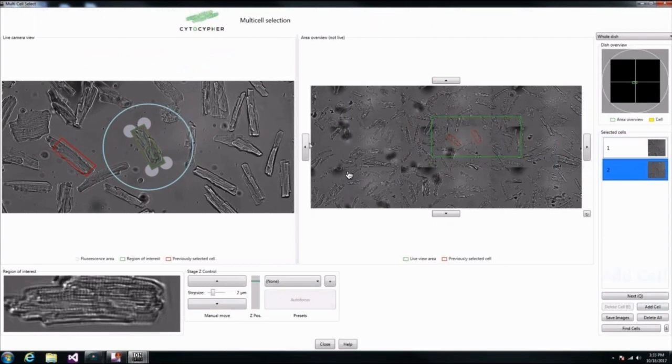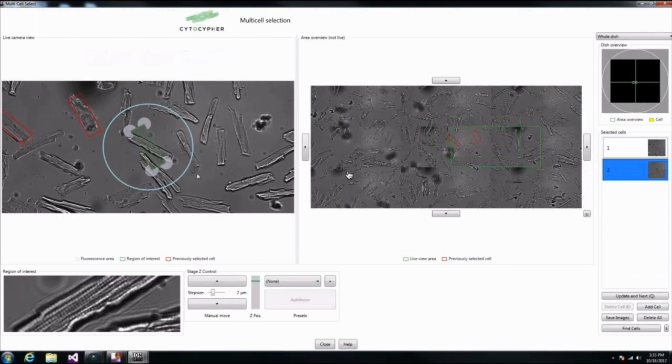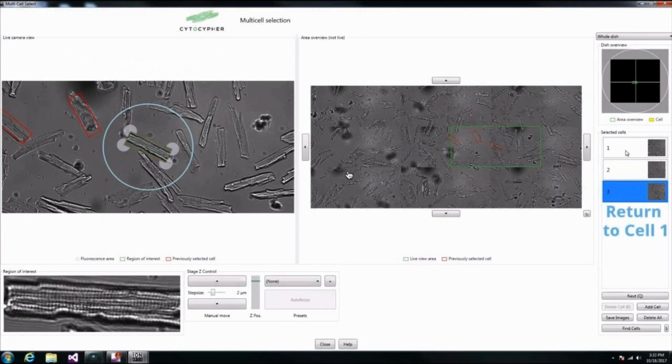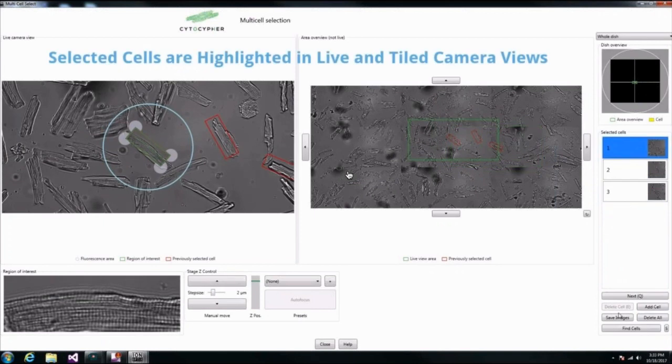The dexterity it requires is a little bit like a computer game, so I find that interns are actually better at this than people who have been using the system for a long time, just because they're faster. We'll solve that when we actually automate the full system.